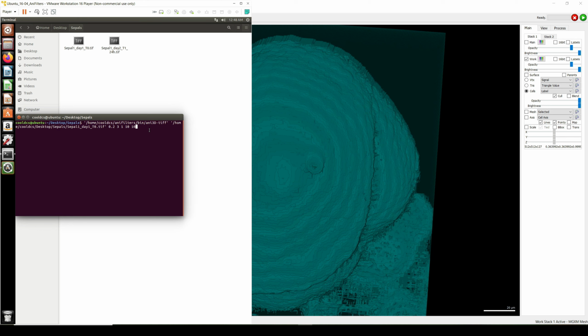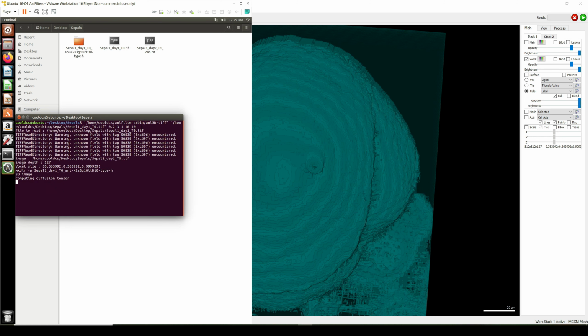To use it, you just need to put the path to the software and the path to the files you want to process. And here you have the parameter. From my experiments, this parameter works best and is enough for cell segmentation. So let's press enter. We will need to do this step for every single confocal stock we want to do segmentation on.